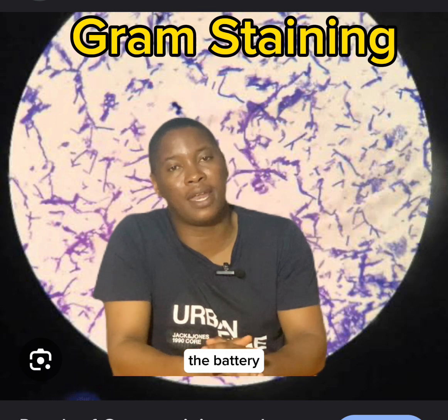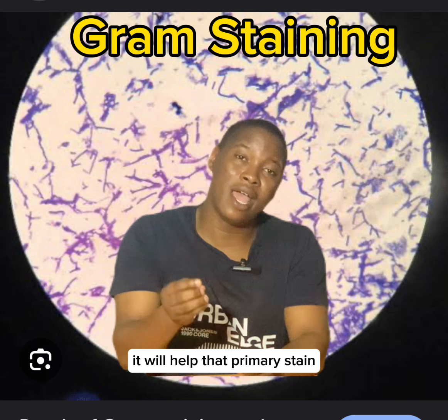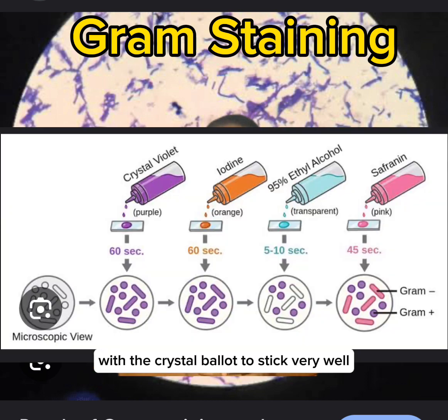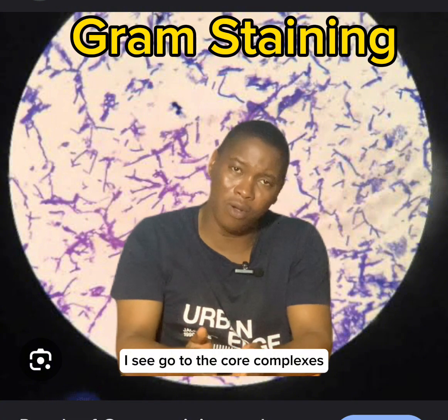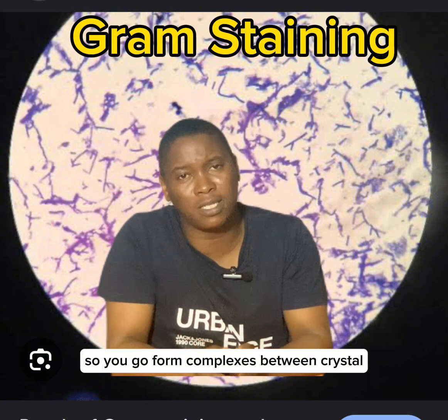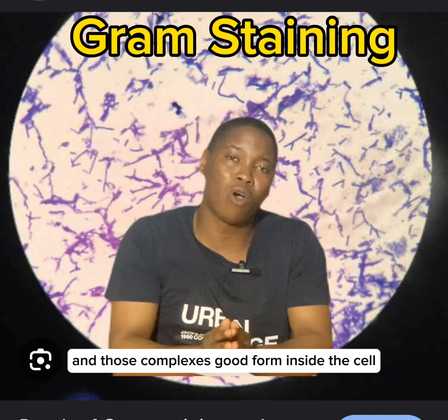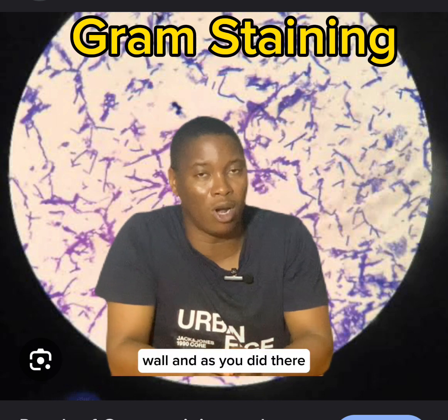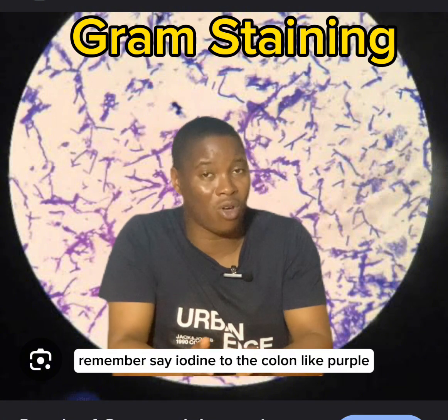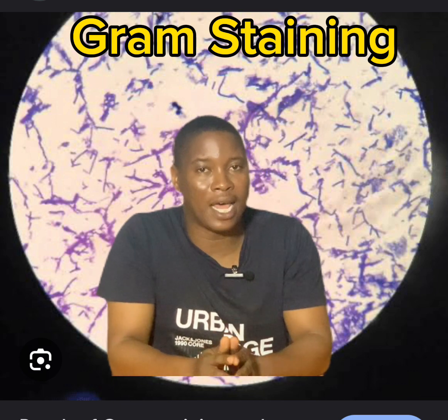Now, the second thing wey you go add na iodine. And iodine na wetin we dey call the mordant. And wetin mordant mean na say e go help that primary stain wey be crystal violet to stick very well for inside the peptidoglycan cell wall. Now, how you go take do this one? The thing wey go happen na say e get wetin we dey call complexes. So you go form complexes between crystal violet and iodine, and those complexes go dey formed inside the cell wall. And as they dey there, you remember say iodine too, the color na like purple. Crystal violet, the color na purple. So they go dey there, they give that bacteria that purple color.